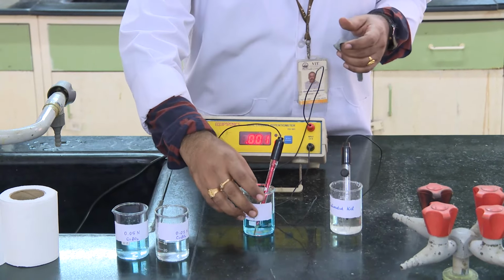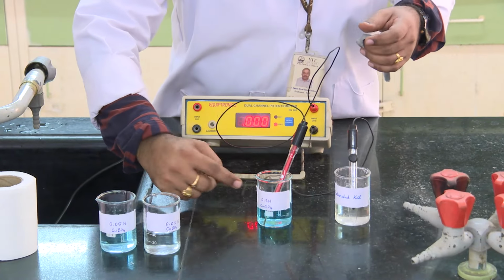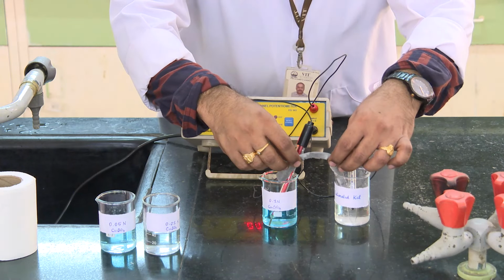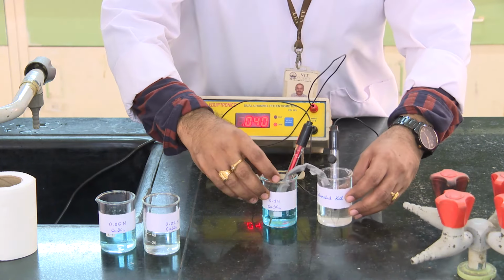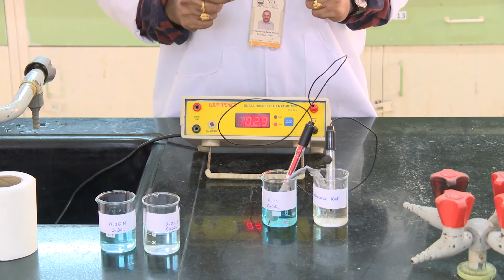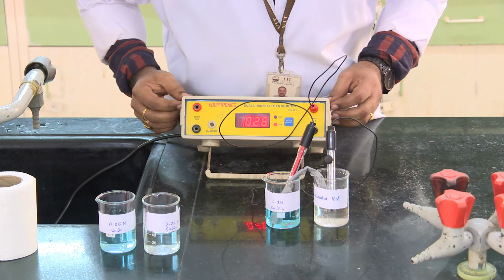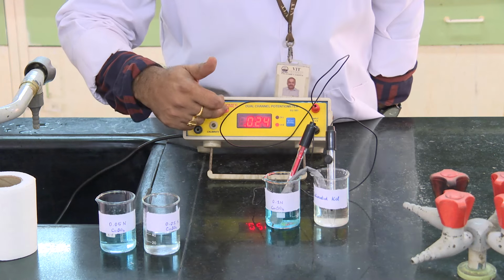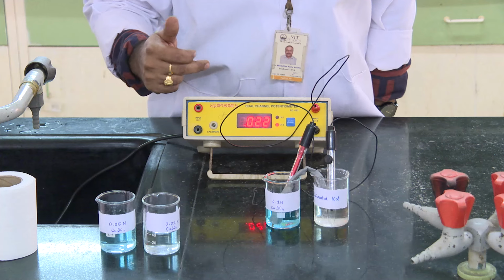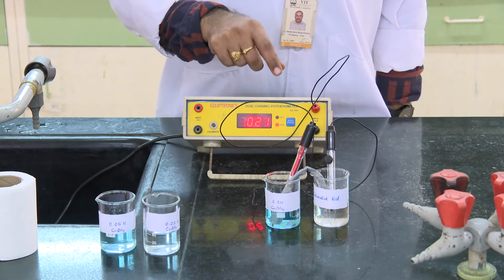Here we are going to combine these 2 half cells. Now we are going to put them together through a salt bridge, and the role of the salt bridge is to facilitate the mobility of the ions and thereby maintain electrical neutrality. Once we get this, you can see the potentiometer reading is going to be 0.024. So, this is the potential for the copper system with respect to the calomel electrode.